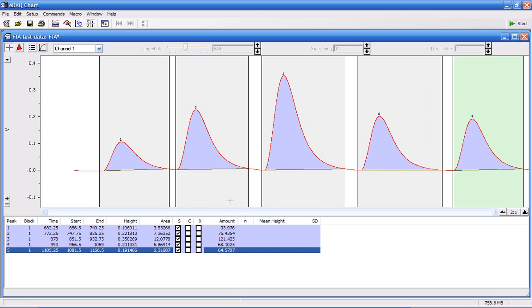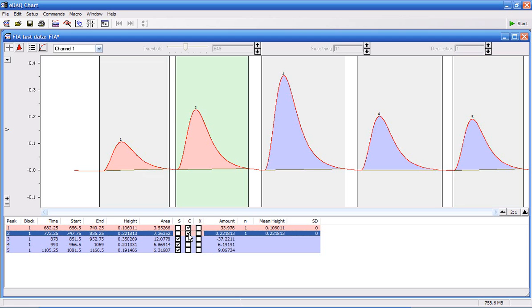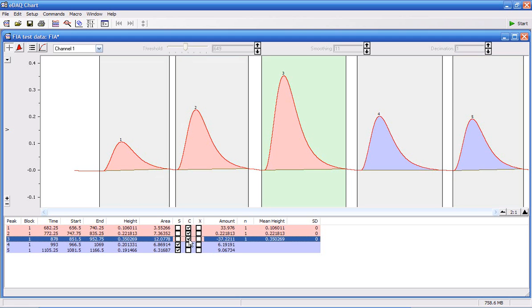Now for this example, I'm going to pretend that peaks 1, 2, and 3 are my calibration standards. At the moment, all the peaks are set to S, which is samples. So I'm going to click peaks 1 to 3 as calibration standards. The software marks them pink to show that they're calibration standards.